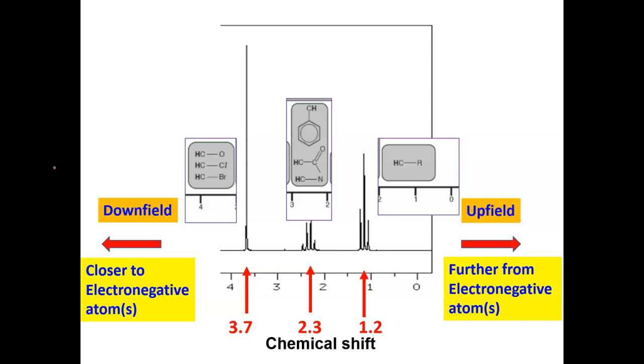The signal, that's a four-part quartet, as you can see, which is centered around about 2.3, is one of those three groupings. Well, we know our molecule is an ester, it is not an arene, and it doesn't contain any nitrogen. So instead of worrying about which one it is, it can only be one of them, and that is hydrogen on a carbon bonding to a C double bond O group. Very common indeed, and watch out for it. Don't confuse that with arene groups, with carbons with hydrogens on them. That's also a very common mistake, to get those two mixed up.